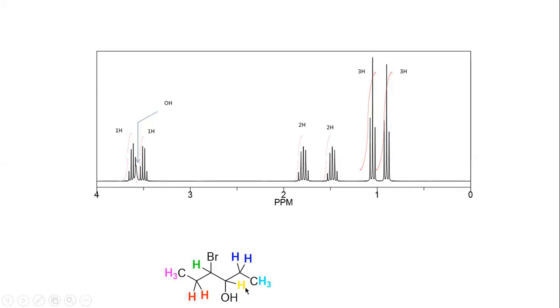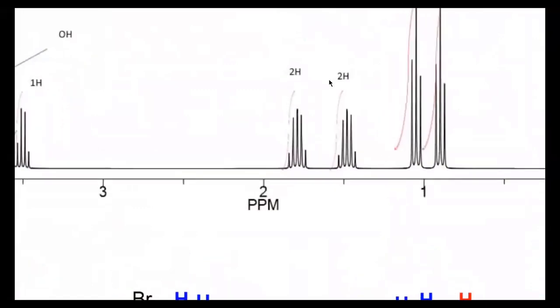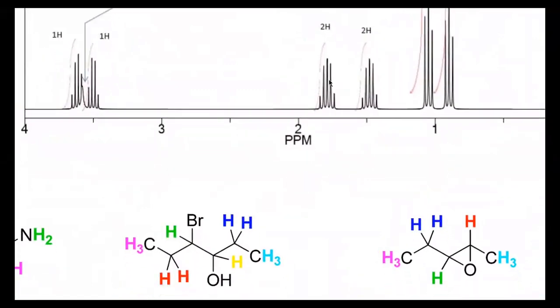I agree with that. So let me pull up my iPad. All right. So this is our spectrum, is that right? And we agree that this is the molecule that it corresponds to. All right. So what's downfield? Somebody already said it, but you're saying that it'll be this hydrogen right here, and this one right here.